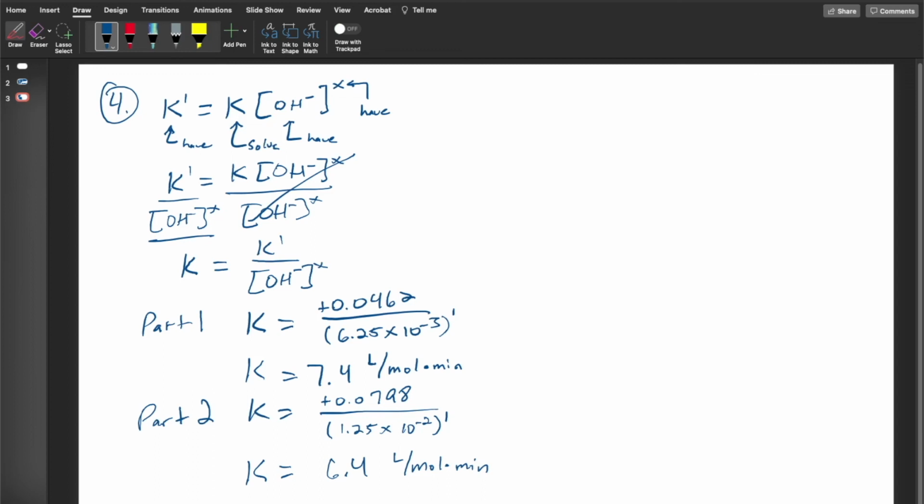And that, my friends, is how you solve for the rate constant, not the pseudo rate constant, but the rate constant for the reaction, right? Because remember that our reaction rate equals k times the concentration of hydroxide times the concentration of crystal violet, which I don't remember the formula for, so I'm just going to put in the abbreviation there. And just as a quick review, we found out that the reaction order was 1 for both hydroxide and crystal violet. That's why our exponents look like they're non-existent, but when there's nothing there, it means it's a 1, right?